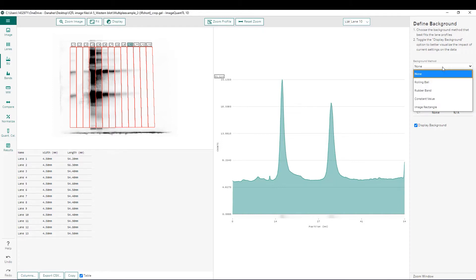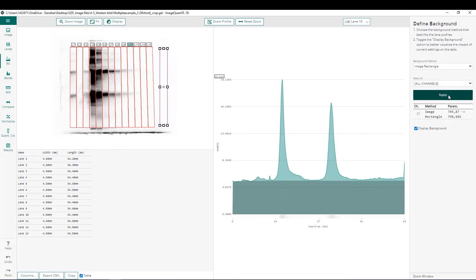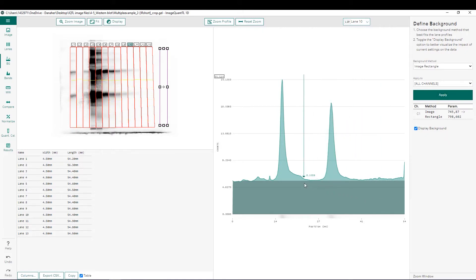The first background subtraction method we're going to look at is image rectangle. Image rectangle allows us to define an area somewhere in our image where the average pixel intensity in this box will be taken away from every pixel in the image. We call this a global subtraction because the same background amount is being taken away from every pixel on the image. The background taken away is defined as a shaded area at the bottom of our intensity profile.